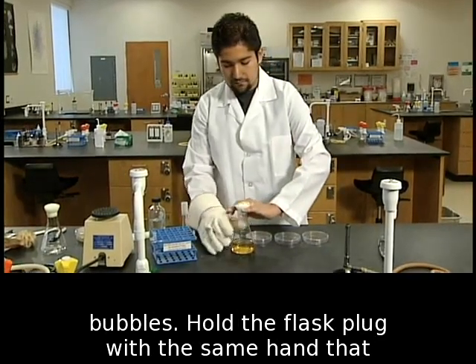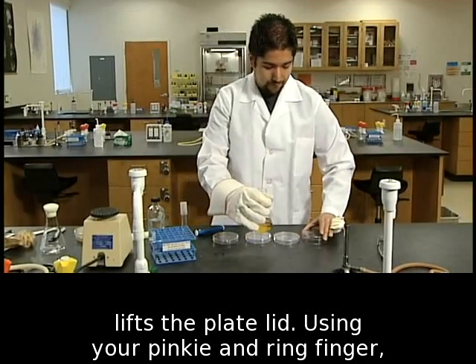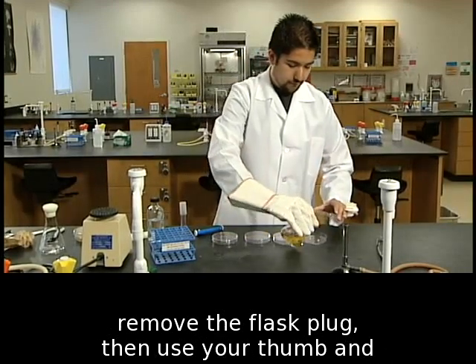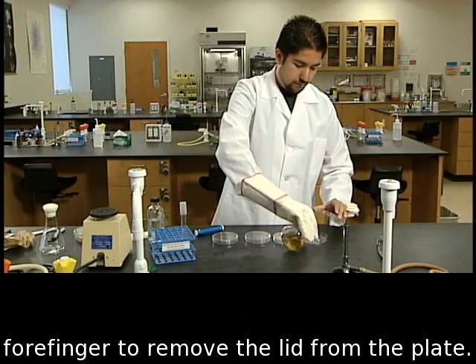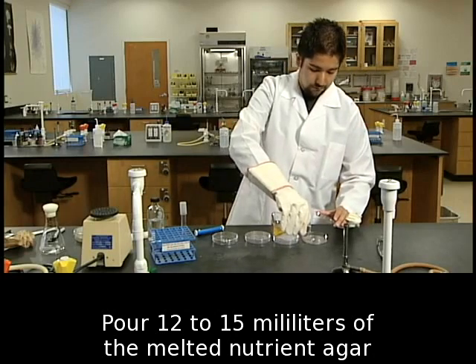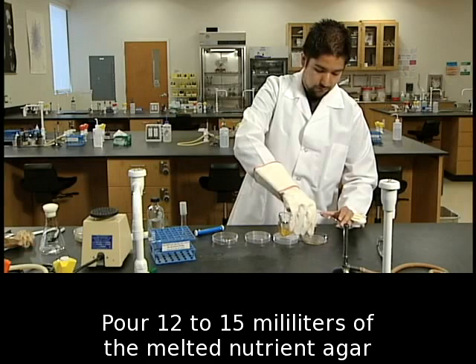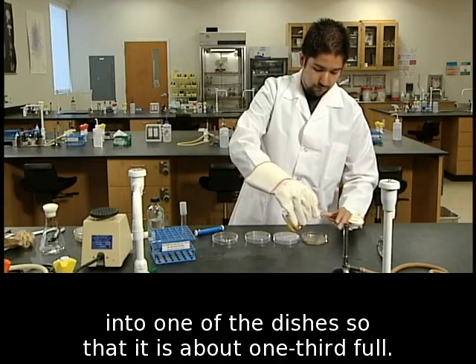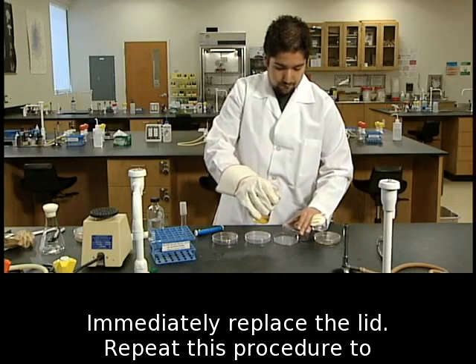Hold the flask plug with the same hand that lifts the plate lid. Using your pinky and ring finger, remove the flask plug, then use your thumb and forefinger to remove the lid from the plate. Pour 12 to 15 milliliters of the melted nutrient agar into one of the dishes so that it is about 1/3 full. Immediately replace the lid.